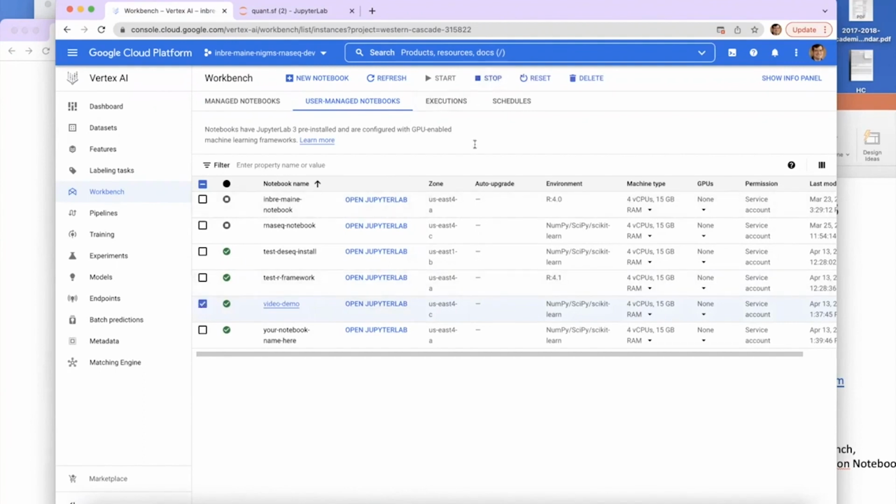And this will then suspend this. And at any point, we can relaunch this after it's stopped. And if we were to do that, when we open it up, it would look just like it did when we last ran it. With all of the steps that we had run, all of the output files we generated would be there.